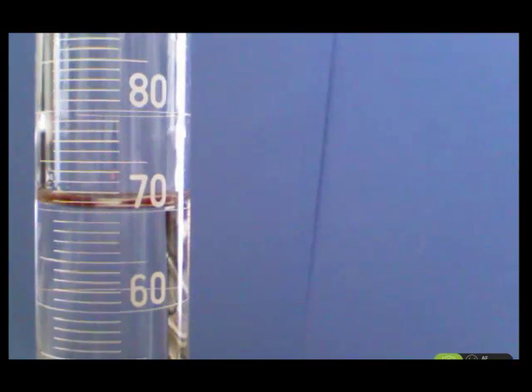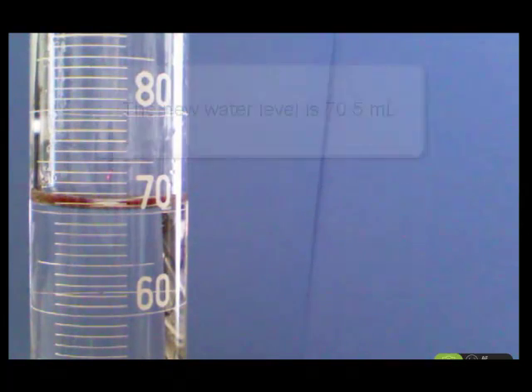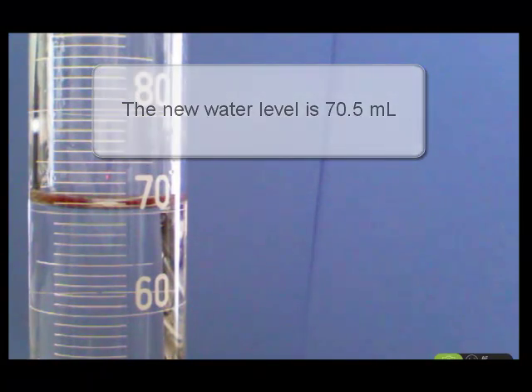Now let's look at our new volume. Well, it's a little bit above the 70 mark, but it's not quite to 71. So we would record 70.5 milliliters. Now, what's the volume of the bolt?